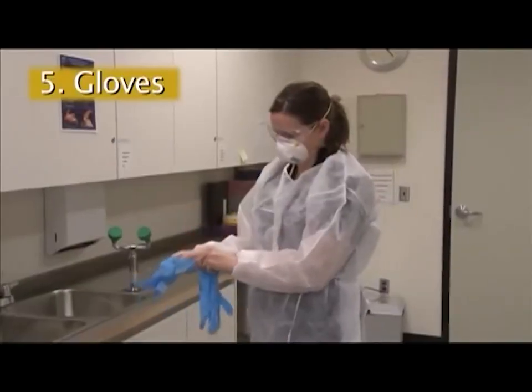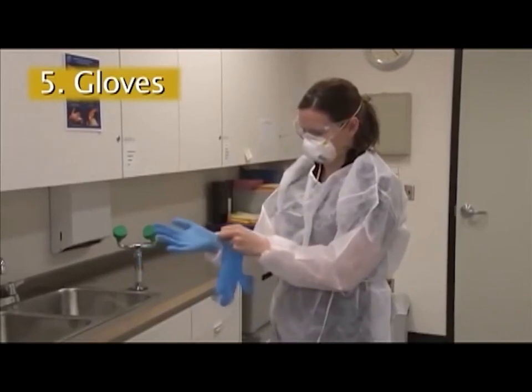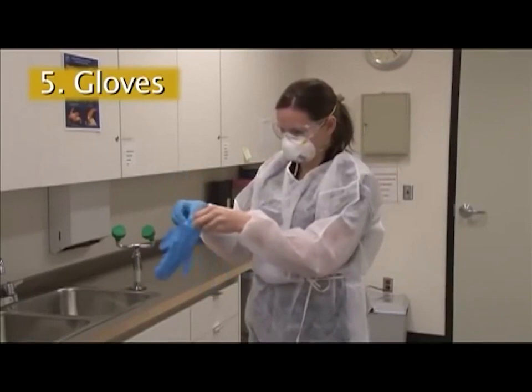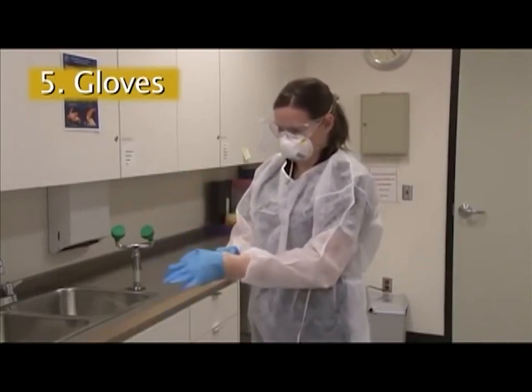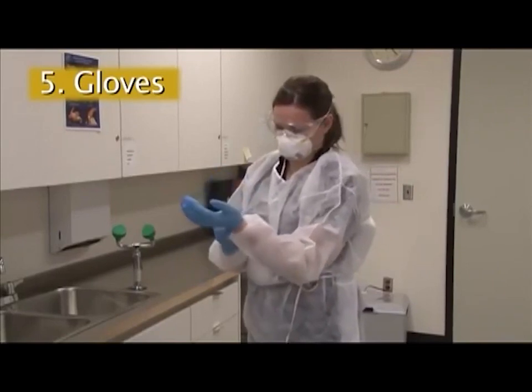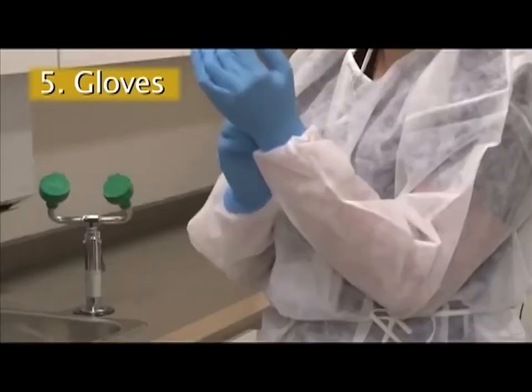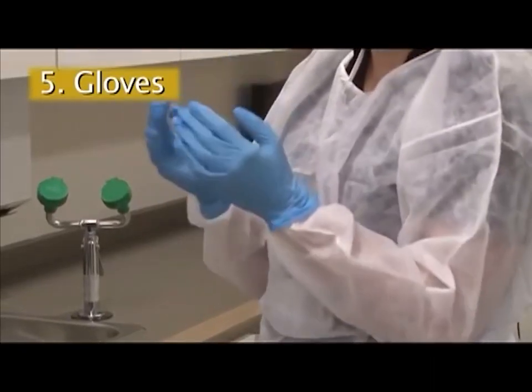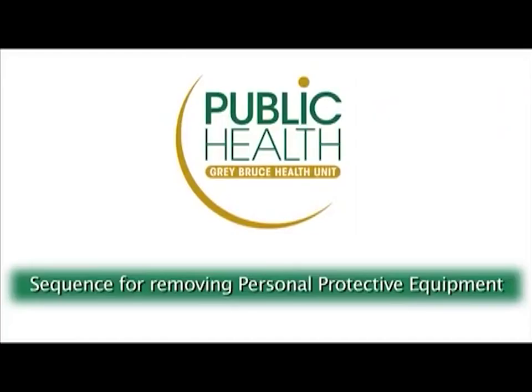Gloves go on last. Insert your hands into the gloves and extend the gloves to cover the cuffs of your gown. Keep your gloved hands away from your face. Avoid touching or adjusting other personal protective equipment. Limit surfaces and items touched. Remove gloves if they are torn. Always perform hand hygiene before putting on new gloves.